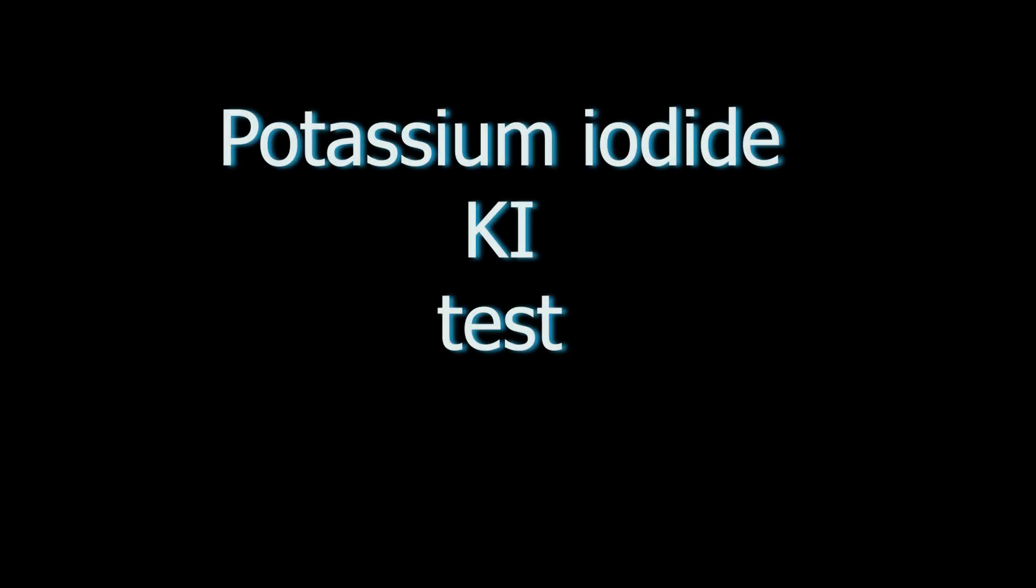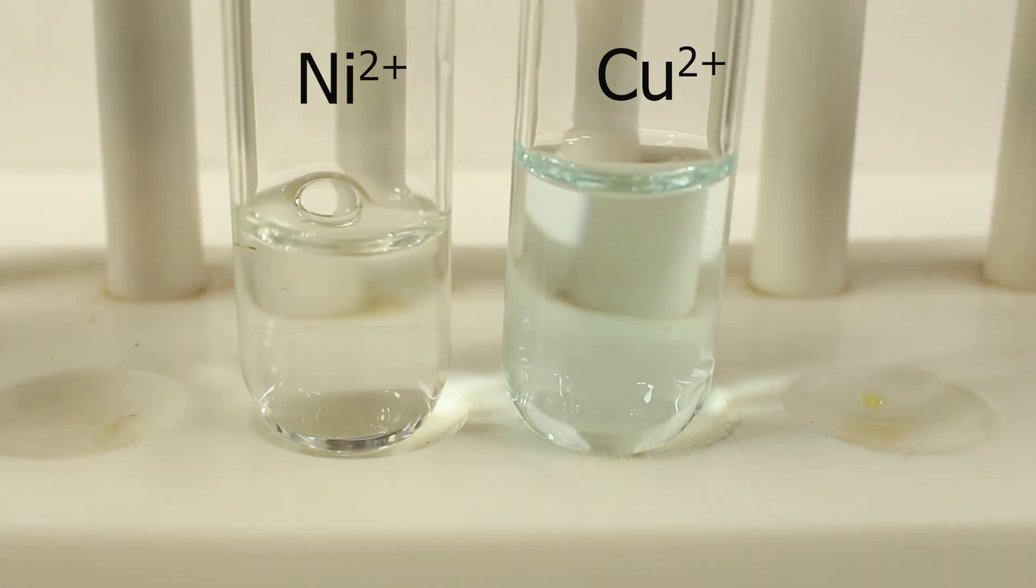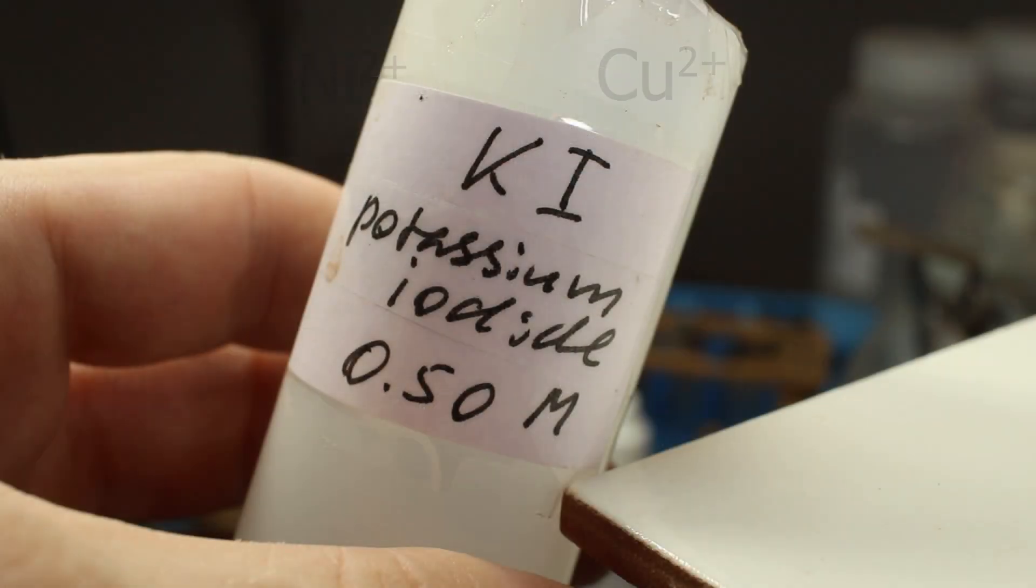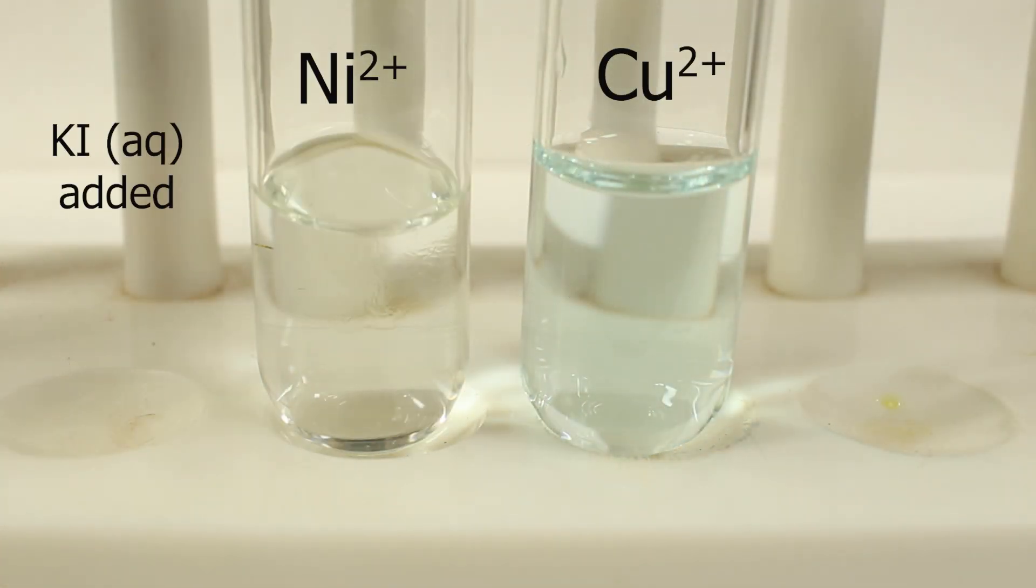Another test, potassium iodide. Here we use the ability of copper II ions to oxidize other substances. Copper II is not very strong oxidizing agent but it's stronger than nickel II for example. Potassium iodide added to nickel, nothing visibly happens.